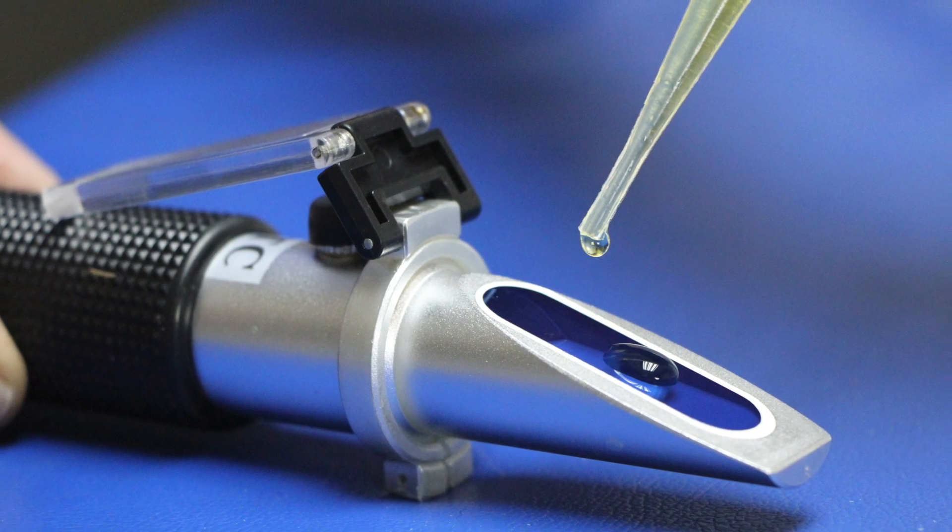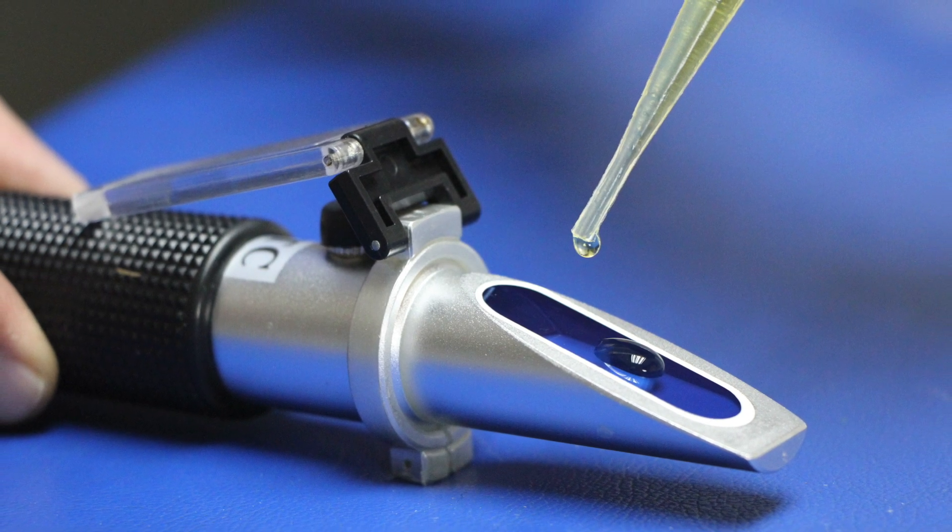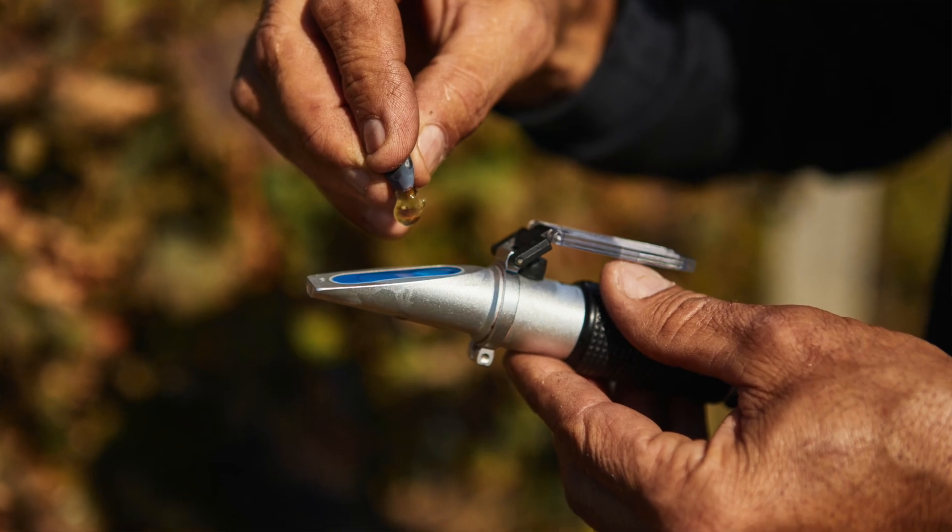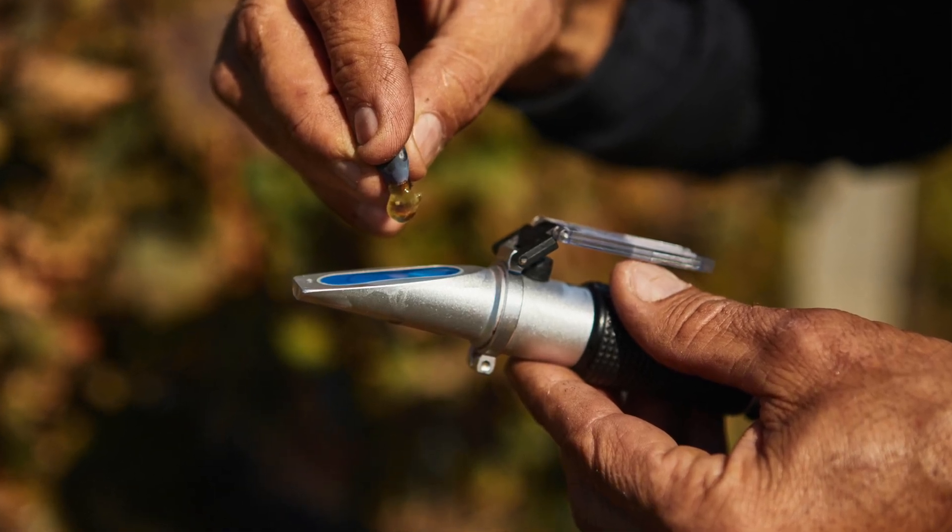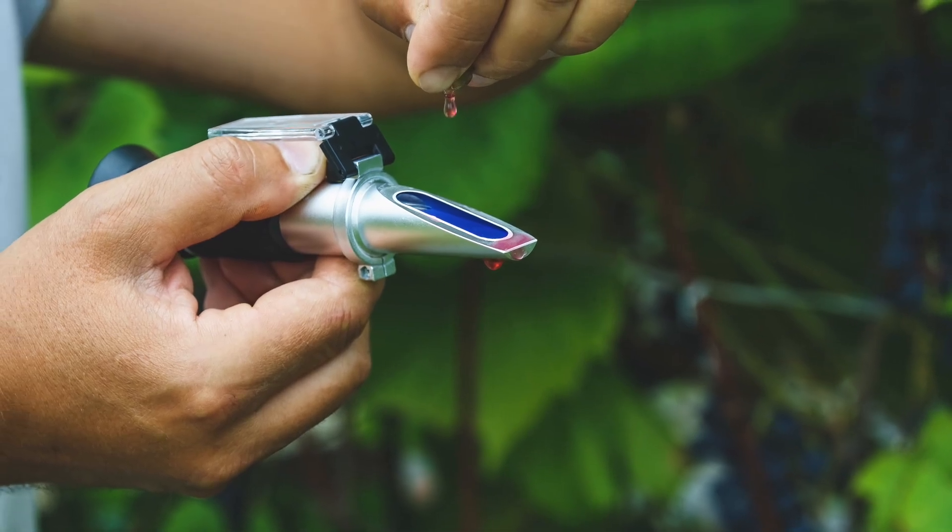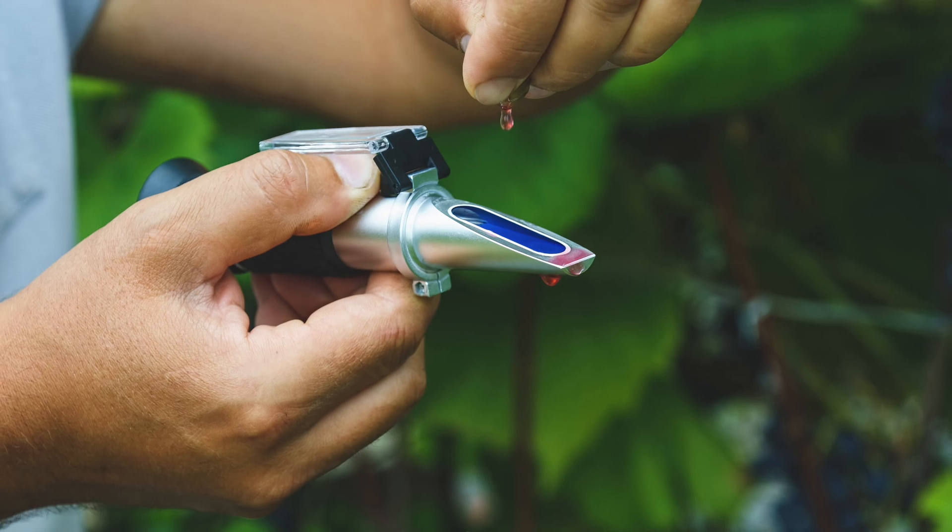Portable refractometers are less expensive and can be easily carried into the manufacturing environment to take measurements. However, they will usually only cover a limited range. Therefore, it may be necessary to purchase several portable models to ensure all of the desired concentrations can be measured.